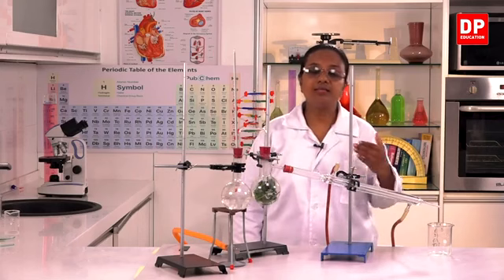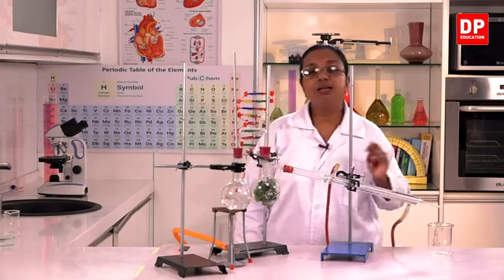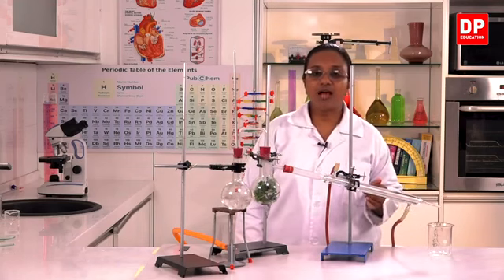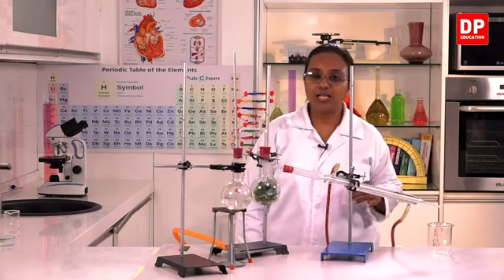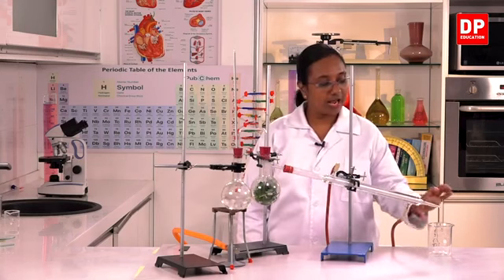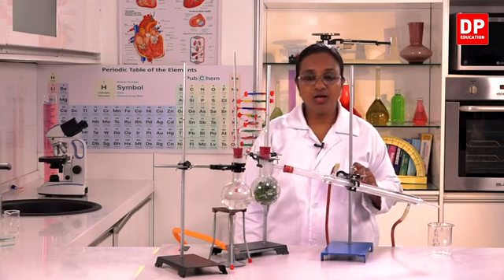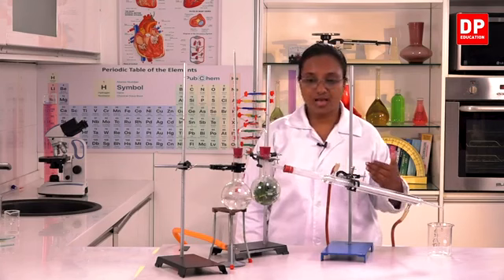They are immiscible liquids. Therefore, when we collect the liquid that is coming from the outlet, the cinnamon oil and water will separate into layers. But for the full process to happen and for us to collect a large quantity of the two, we need to continue the process for a long time.